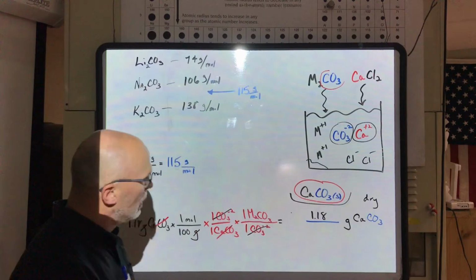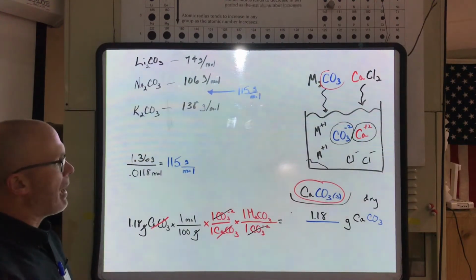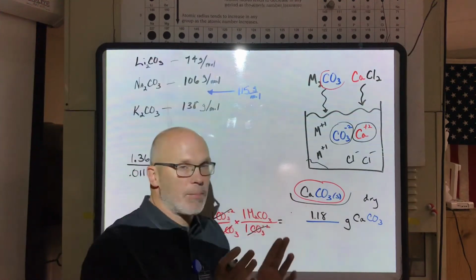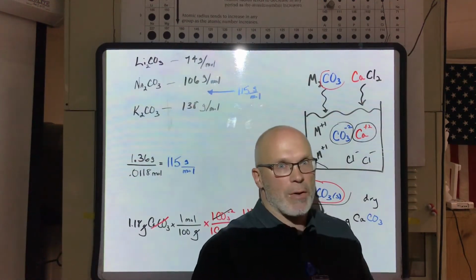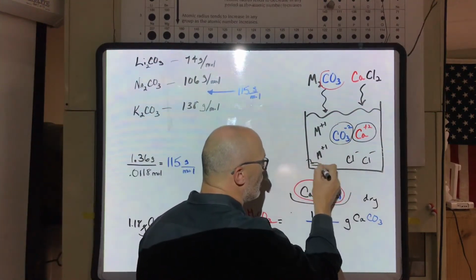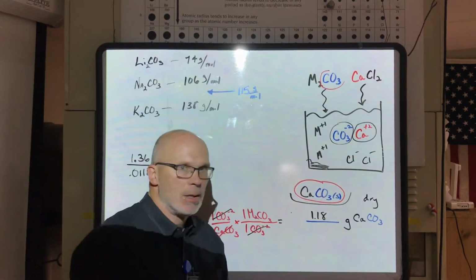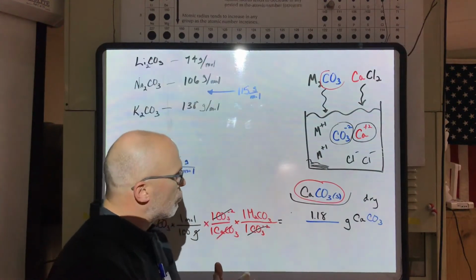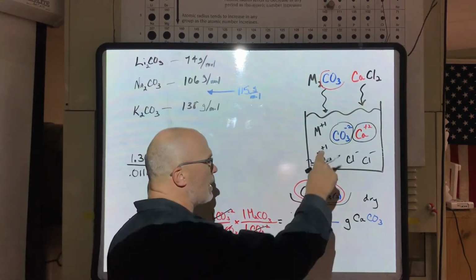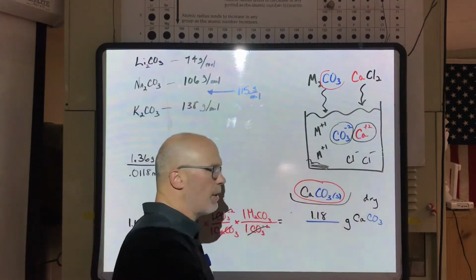Okay, number 1. We're going to talk more about all the errors at the end of this, but I want to talk first about what's a major error. Now, when we precipitated out the calcium carbonate, we filtered and tried to collect all of the solid that appeared in this ionic crystal that developed.